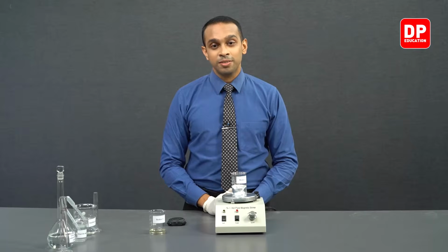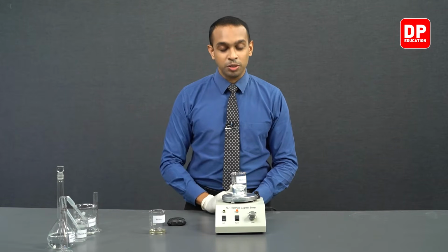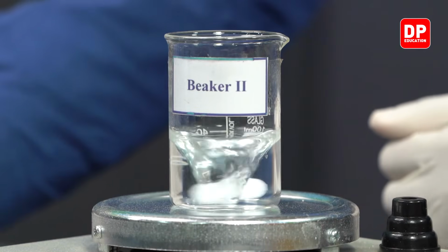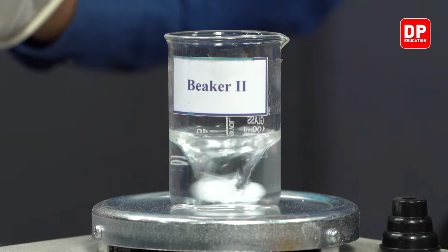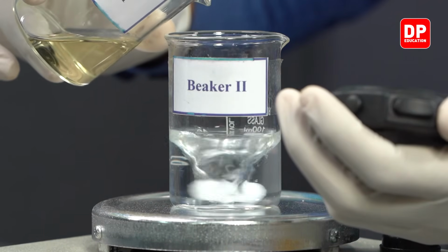So after that, we are going to be adding our beaker 1 content into this beaker 2. Now students, as we add the Fe3 plus aqueous ions or acidified Fe3 plus aqueous ions into the medium, we will start our stopwatch.